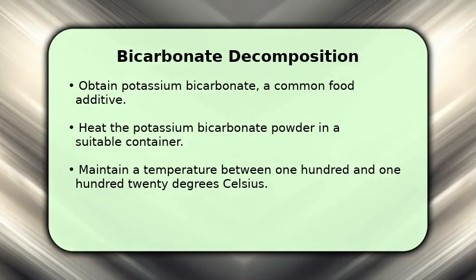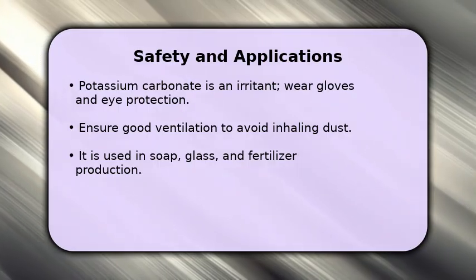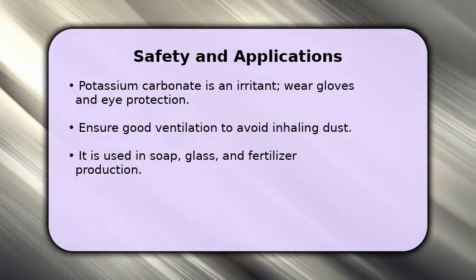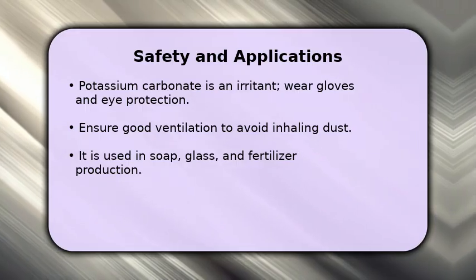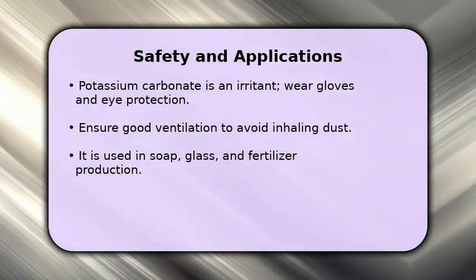When working with potassium carbonate, safety is paramount. Always wear protective gloves and eye protection, as it can irritate skin and eyes. Ensure your workspace is well ventilated to prevent inhaling any dust.